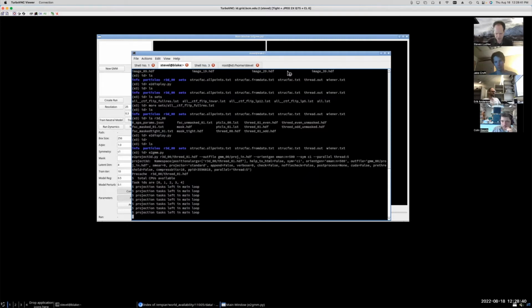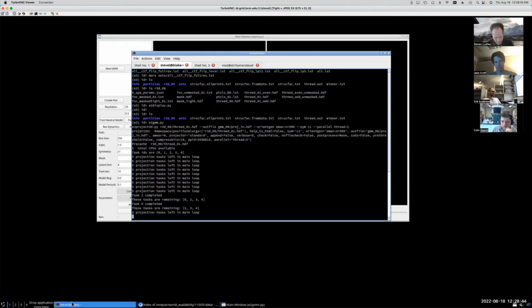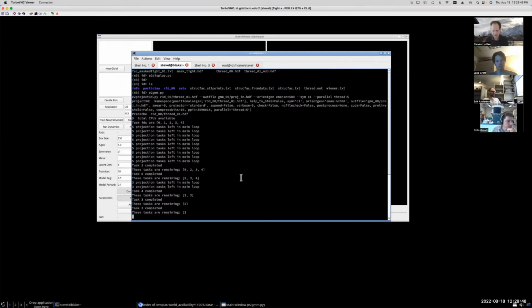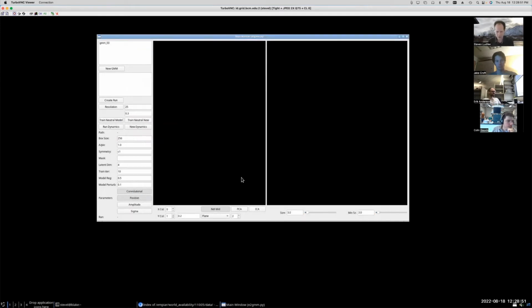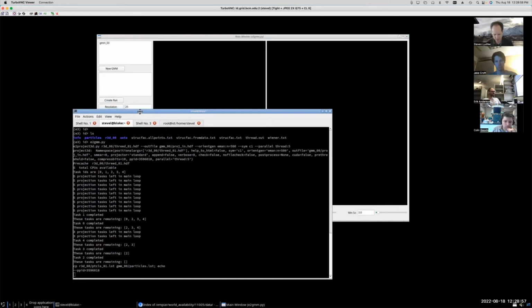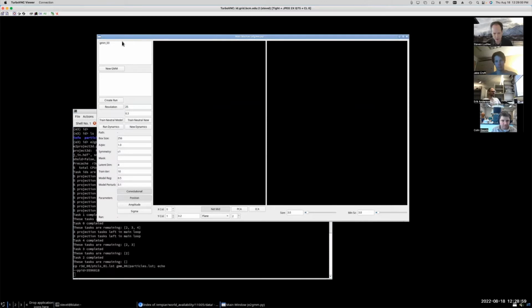Surprised it's taking that long. It should be pretty fast. Oh, maybe there we go. It wasn't in the front. Okay, now it's done. Now let me bring that window back to the front, and I'm going to move it down a little bit here so we can see if it's doing anything in the background. Okay, now I'll click on that, and we still won't really see anything.